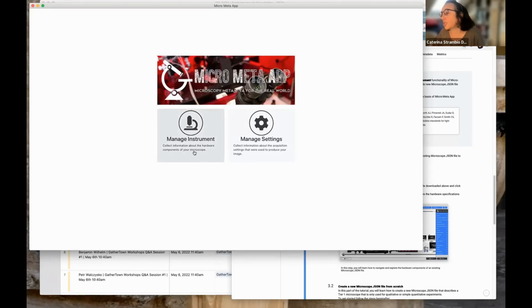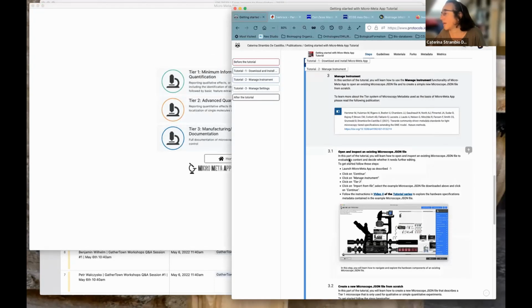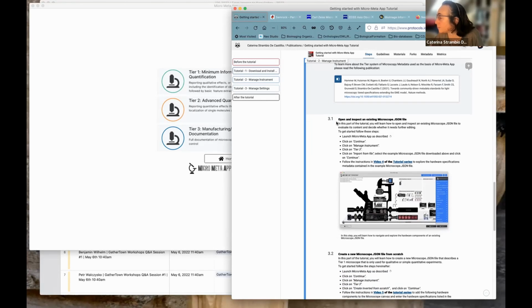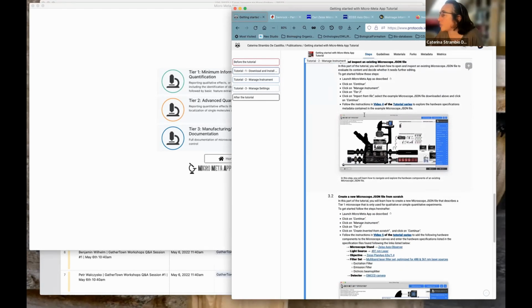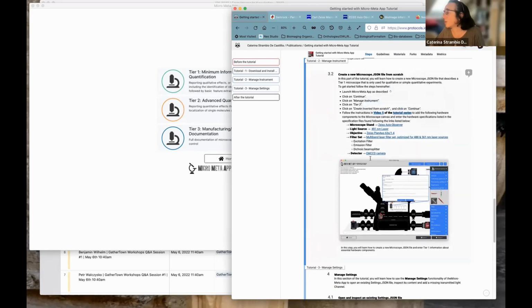Okay, so in order to start from scratch, here in this protocols.io I have a note that tells you that if you want to review what I just told you, there is a video that tells you pretty much everything, a little more of what I've told you so far. But let's say that you want to start from scratch. Here on protocols.io, you can find, for example, links to different components that you may want to record, but you can also do it with your own microscope and just get started with it.